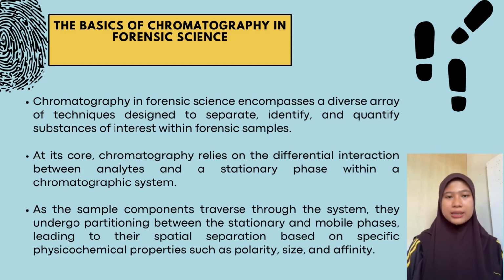Chromatography in forensic science encompasses a diverse array of techniques designed to separate, identify, and quantify substances of interest within forensic samples. At its core, chromatography relies on the differential interaction between analytes and a stationary phase within a chromatographic system. As the sample components traverse through the system, they undergo partitioning between the stationary and mobile phases, leading to their spatial separation based on specific physicochemical properties such as polarity, size, and affinity.